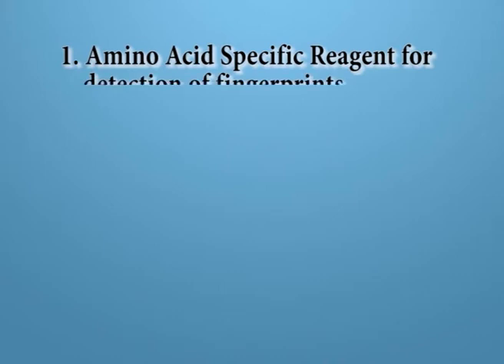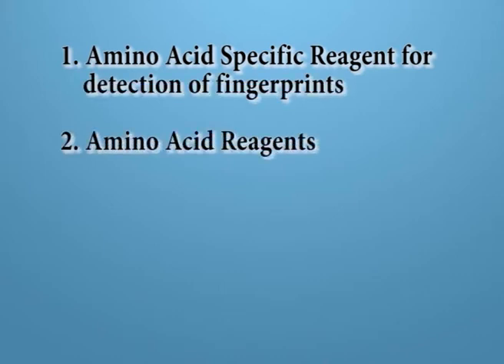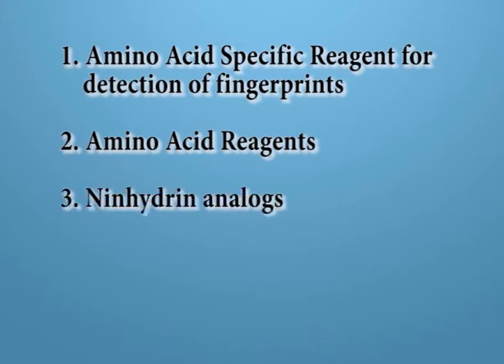Let us start our today's lecture with a brief look at what we will be learning regarding the modules today. First is amino acid specific reagent for detection of fingerprints, then we have amino acid reagents, then we have Ninhydrin analogues, then is DFO, and last is the conclusion.